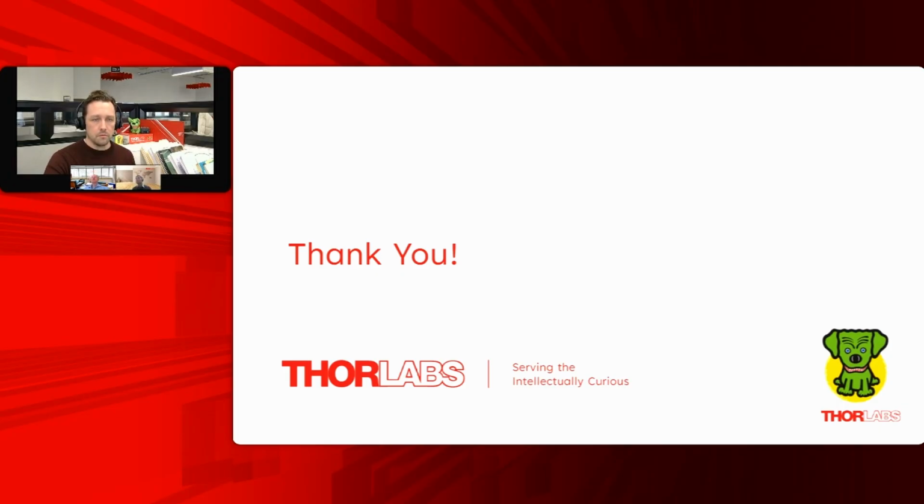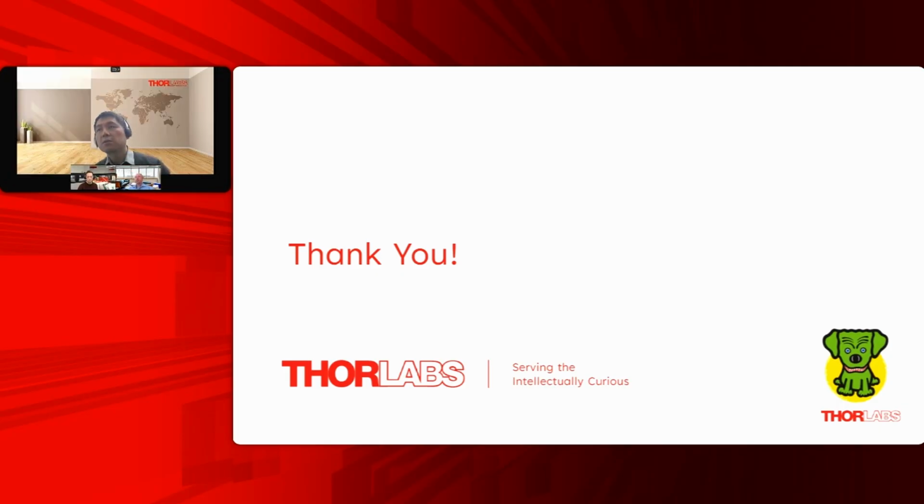Okay. So ICL is also a semiconductor laser, but it uses the so-called interband transition, not intersubband transition. On this end, it's similar to a traditional laser diode, but there's no p-doping in the ICL. The hole is generated by a so-called semi-metallic interface. Because of that, you can stack multiple stages together to have high gain, similar to QCL. That's why you have the cascade in the name.